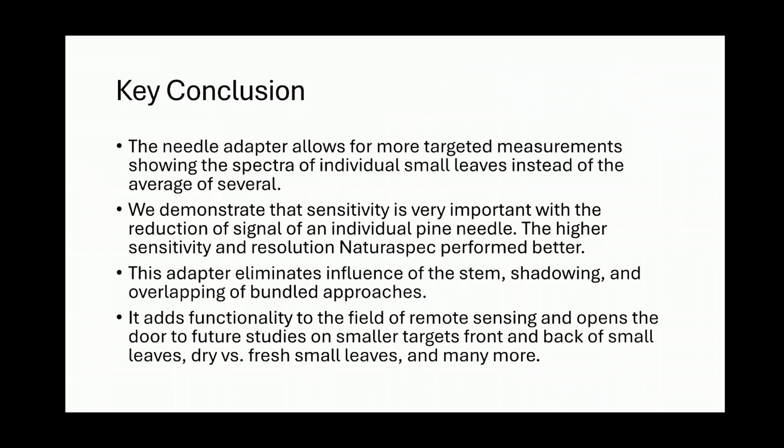We demonstrate that the sensitivity is incredibly important with the reduction of signal. However, it is overcome using our higher resolution, higher sensitivity instruments. And the pine needle adapter is able to take out the influence of the stem in bundled measurements.